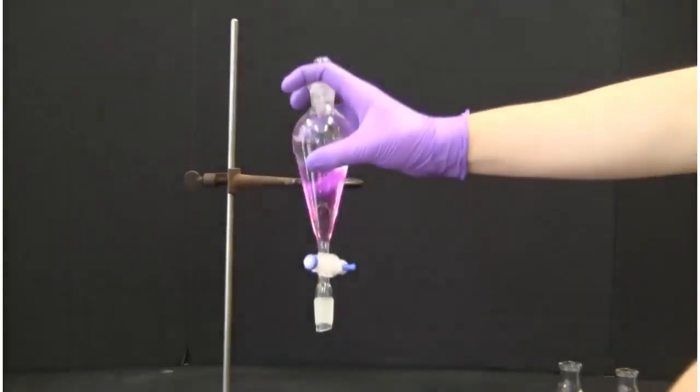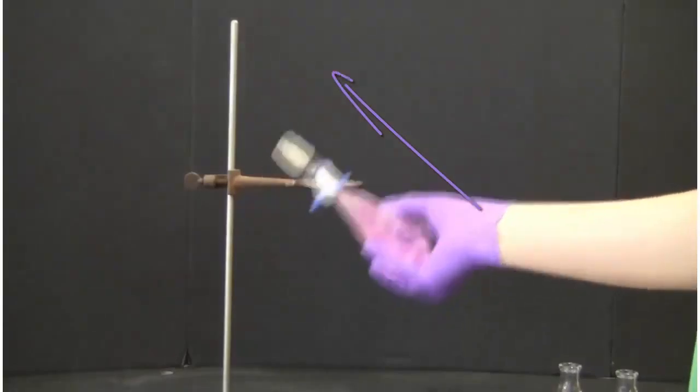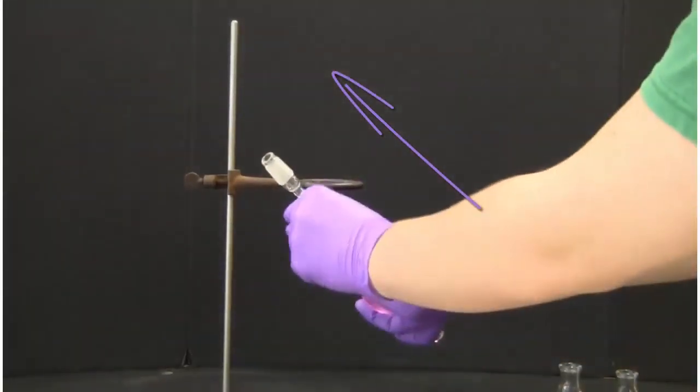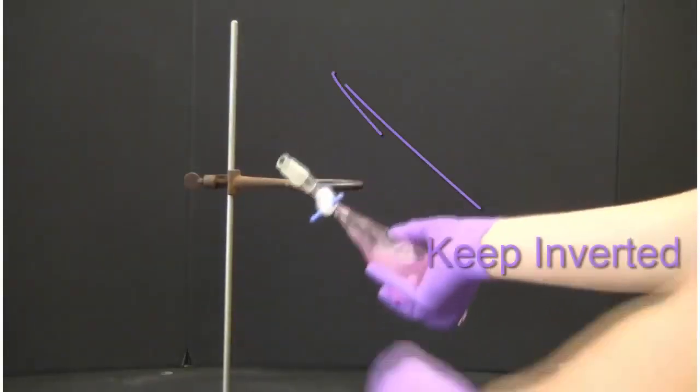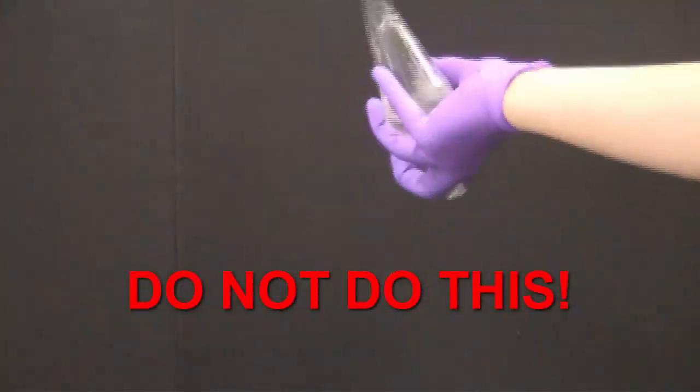Once the stopper is securely on, the funnel is manually shaken. Remember the funnel must be shaken pointing away from the body and away from your lab partners. Proper shaking technique involves keeping the funnel inverted. Do not flip the funnel while mixing as this may lead to leaks.